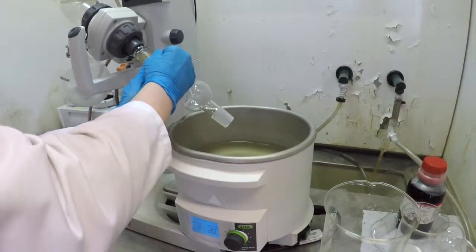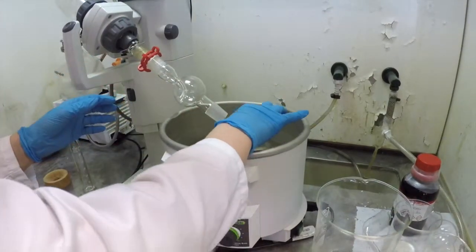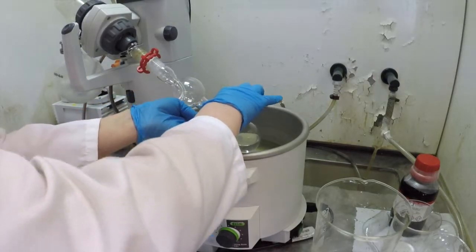The trap is used to minimize product loss, as product that gets bumped into the trap can be rinsed out and back into the round bottom flask.